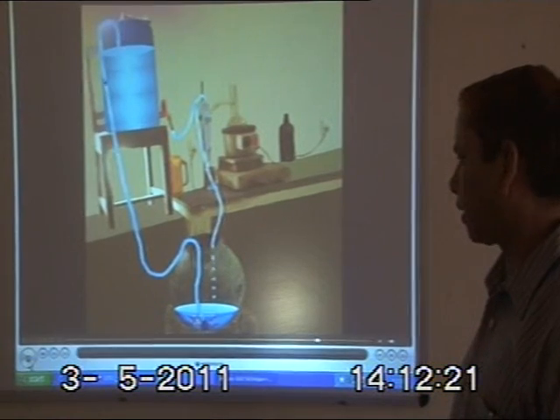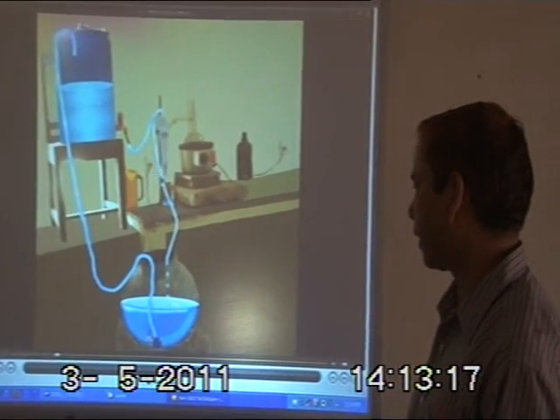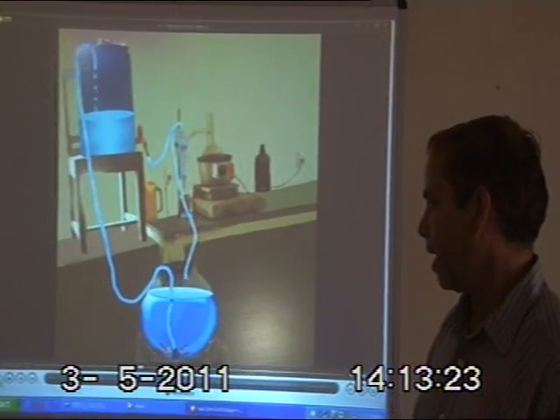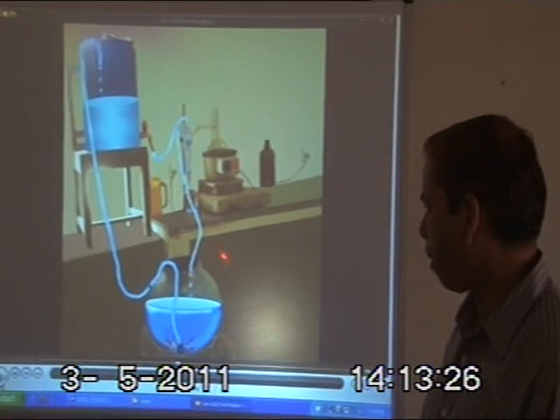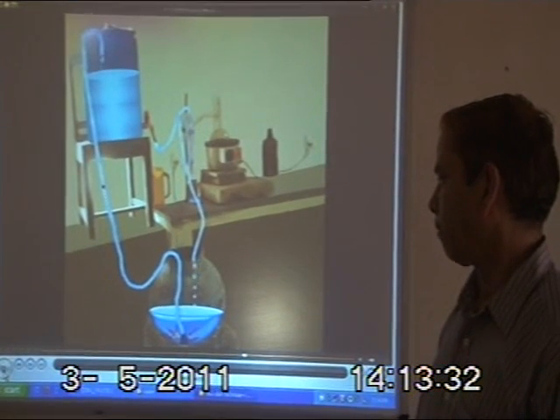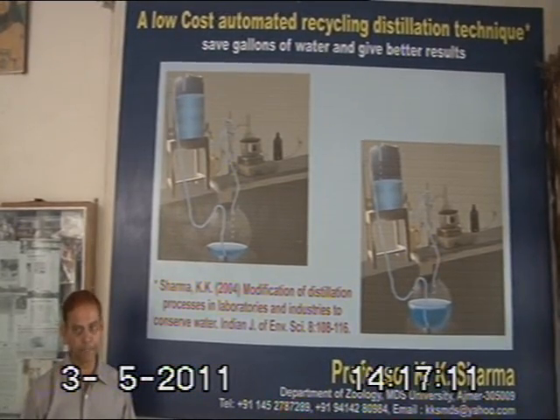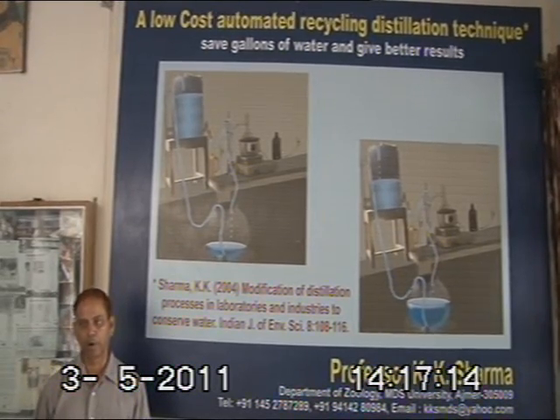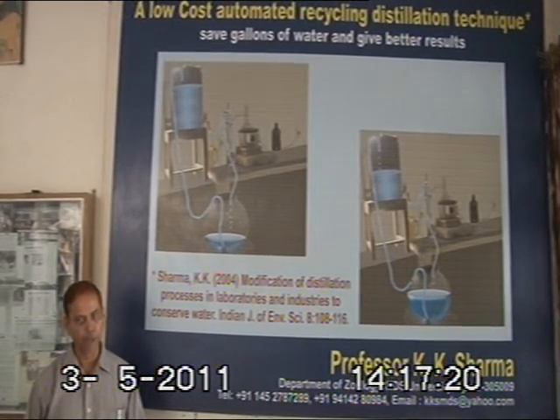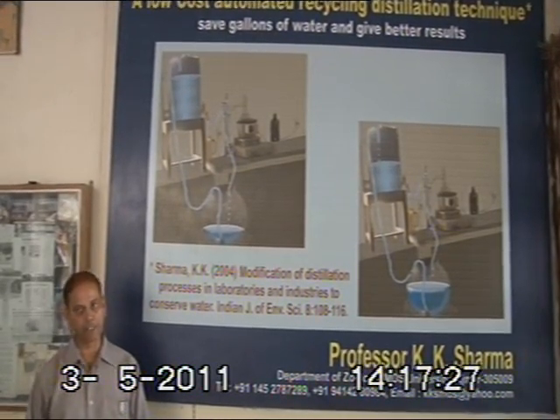This way the water is recycled again and there is no wastage of water during this process, saving gallons of water in laboratories and industries. The same water can be recycled in this unit several times without any waste. This is a very advanced technique that saves a lot of water during the distillation process. This technique has been published and widely circulated, and many laboratories and industries in India as well as in other parts of the world are now using it to save water from the condenser unit during distillation.